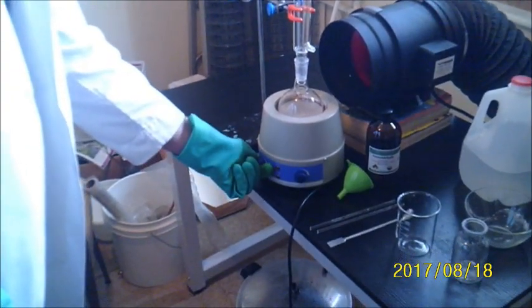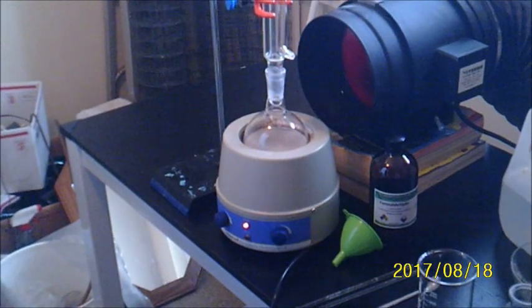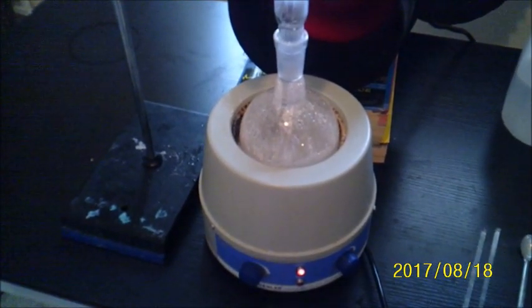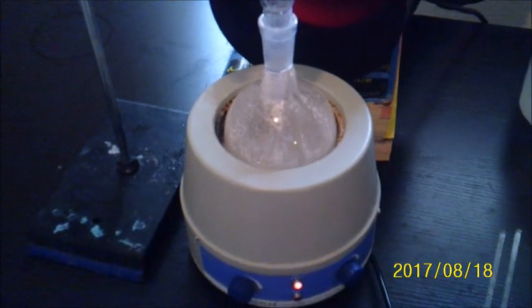We're ready to begin heating the solution, and I will be heating it for an hour. The solution is starting to boil after about a half an hour. We want to heat it for an hour at boiling, so once it begins to boil, you want to heat it for an additional hour. You can see we have a nice boil going there.